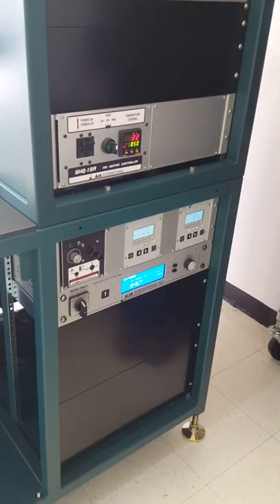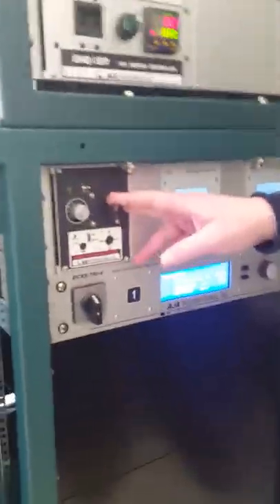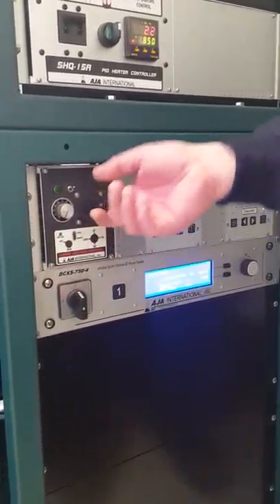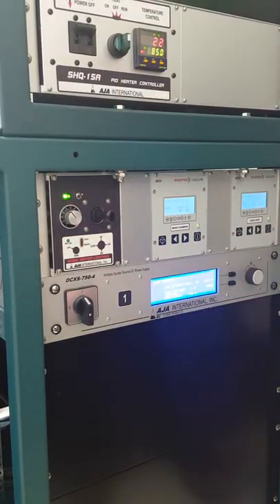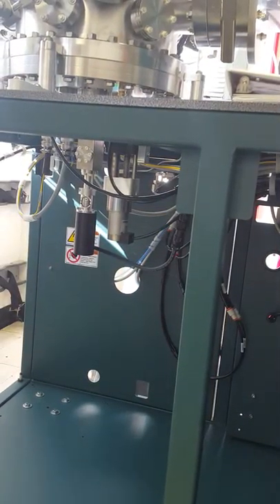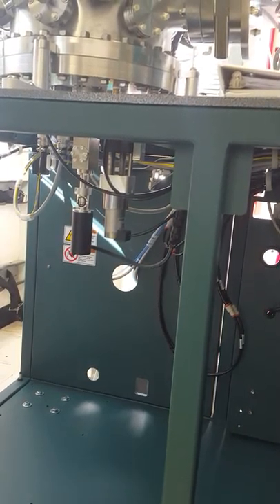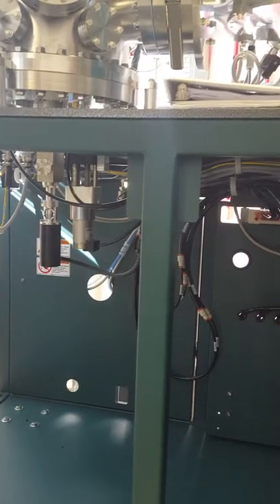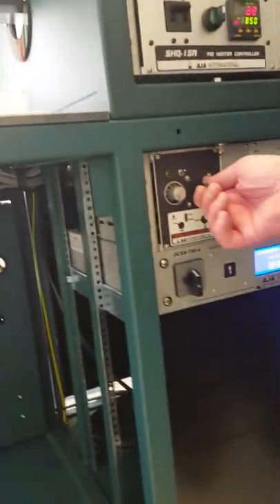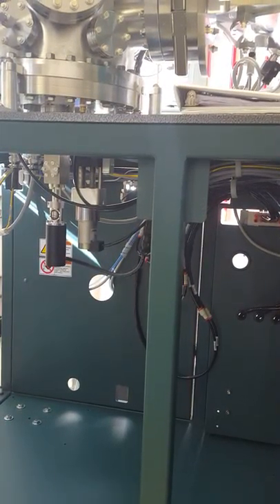Here we have the sample rotation controller for rotation and Z-axis motion. You just turn it on and you can see it moving. Using this stick to go up and down, you can move in the Z direction. On this particular system you can also manually rotate it, though it's not something you really need to do.